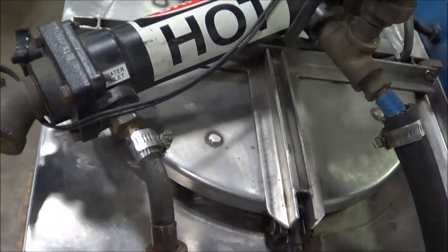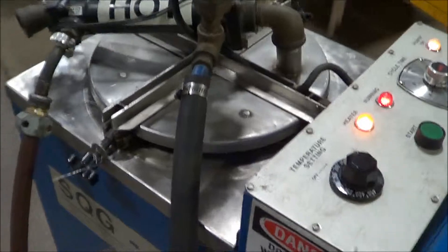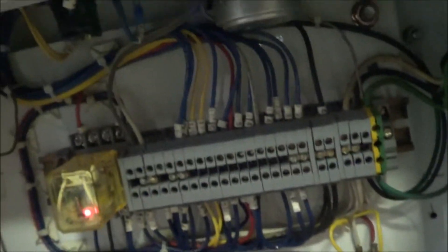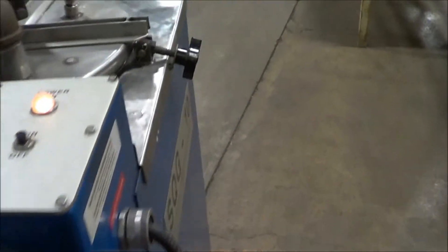You can see the cooling water inlet here — this is for the heat exchanger on the unit. Taking a look at the inside of the cabinet, it's in very good condition and has been completely gone through. You can see it's hooked up to just 110 single phase.